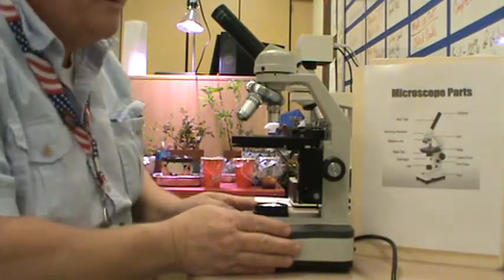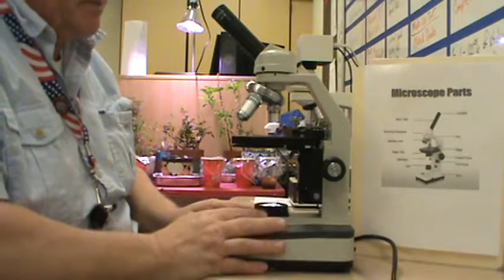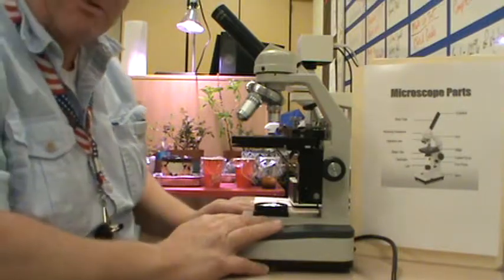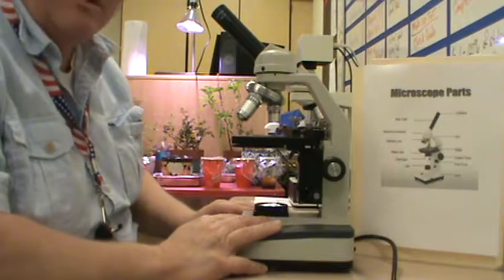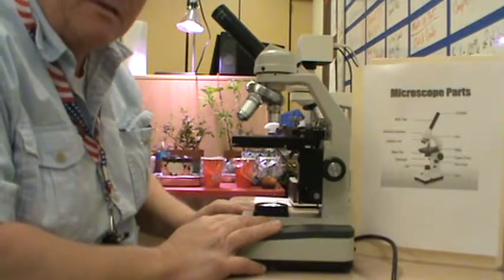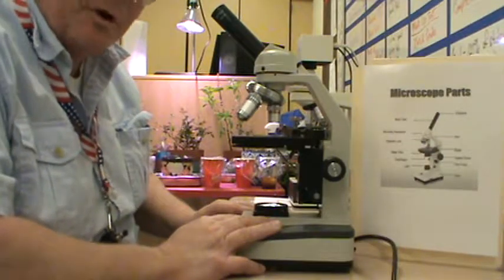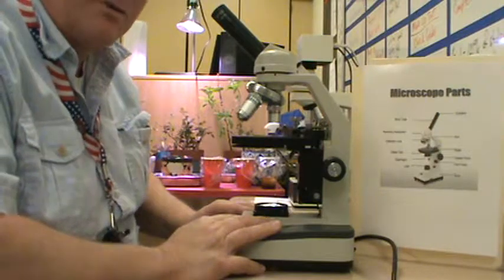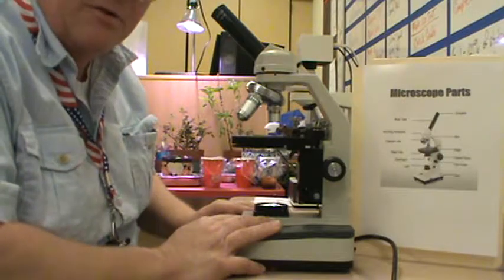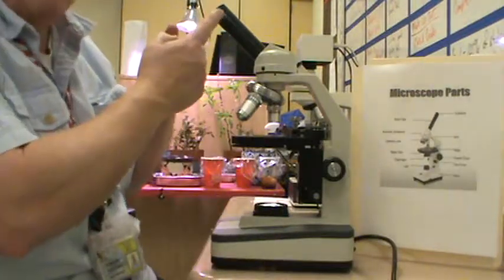This is one of our older microscopes that we have here at Hobbs High School. And this was actually passed down to the science department from the agriculture education department, from what I understand. I pulled these out of storage because I have about 140 students that I teach here at Hobbs High School, and I wanted them to have some experience on the microscope. So we've taken the time, all classes learn the parts of the microscope, but I had an extra microscope lab for them to do while we were also doing our osmosis and diffusion lab, which you can also find here on the channel. All right, starting at the top, we have the eyepiece.